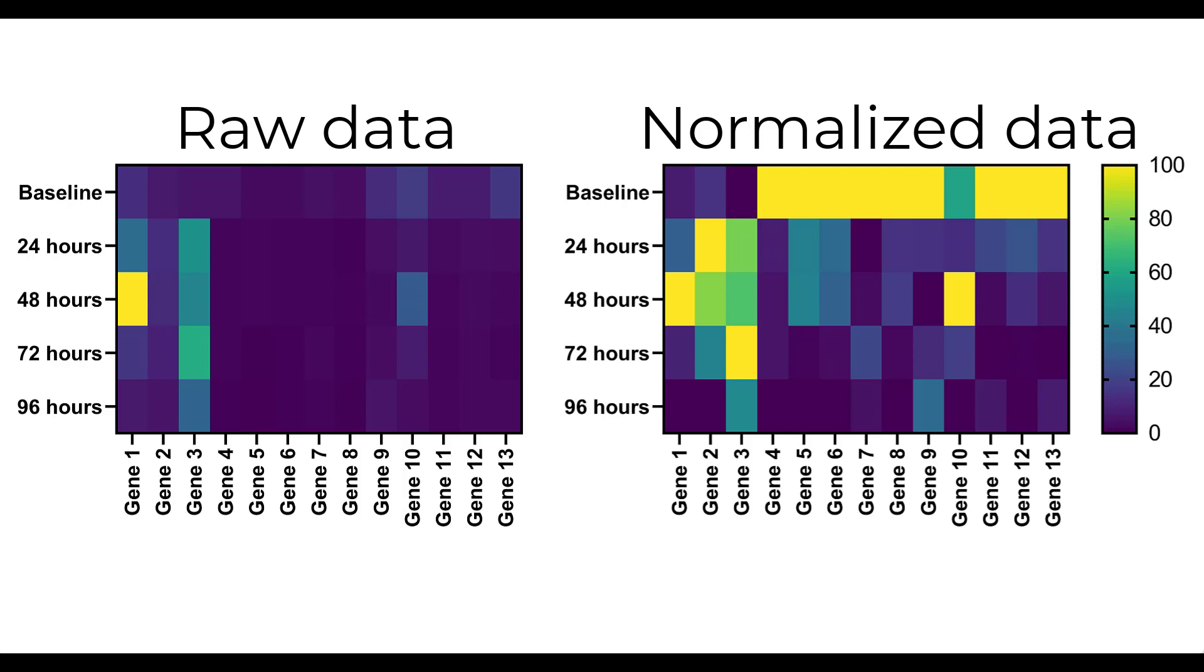Now, the data for each gene has been normalised so that the lowest gene expression value is set at 0% in dark blue, and the highest gene expression value is set at 100% coloured in yellow. This makes it much more convenient to visually inspect and interpret the heat map.